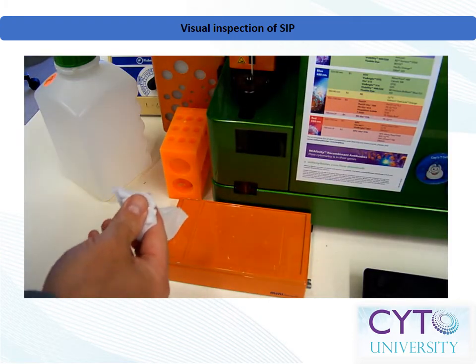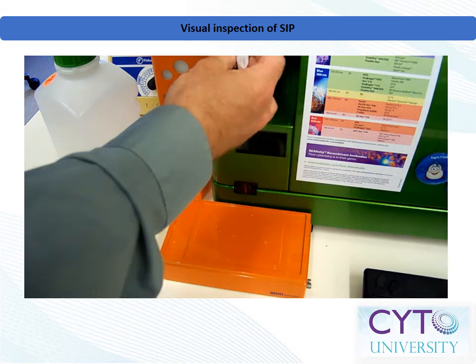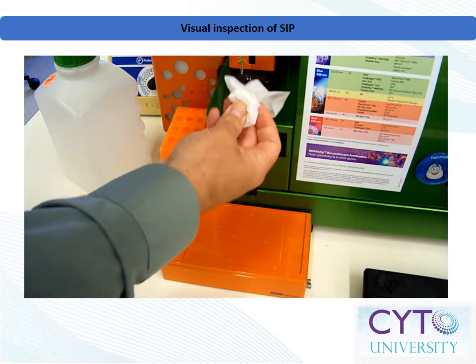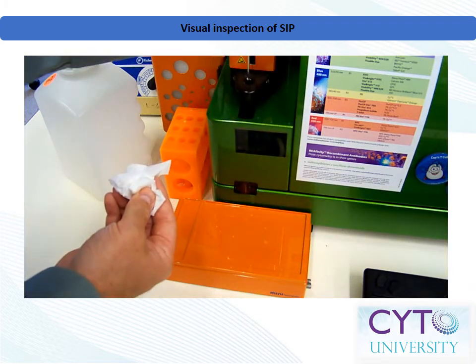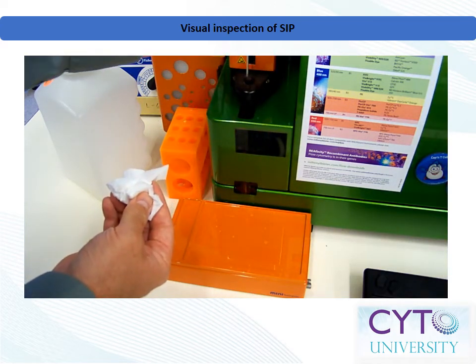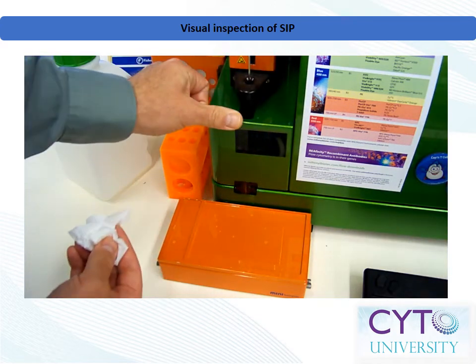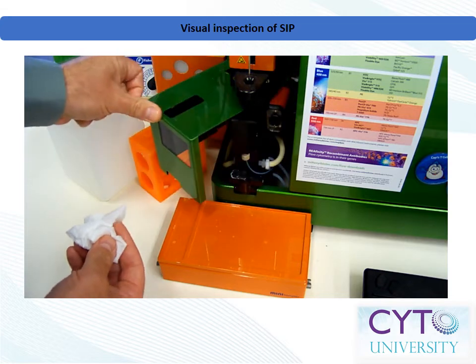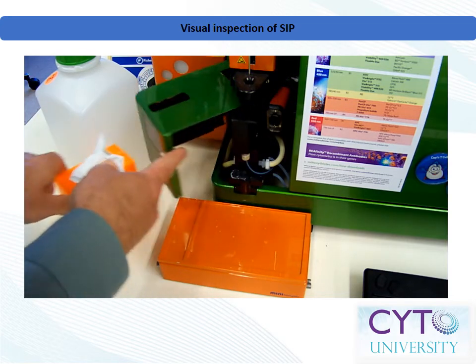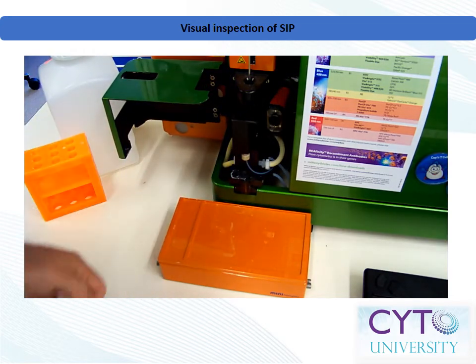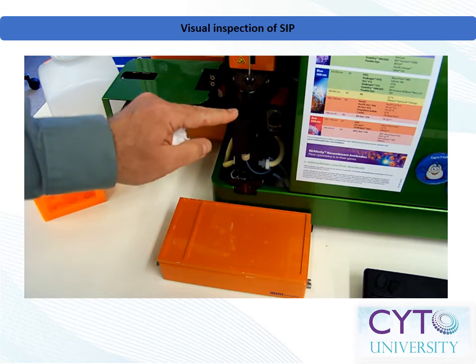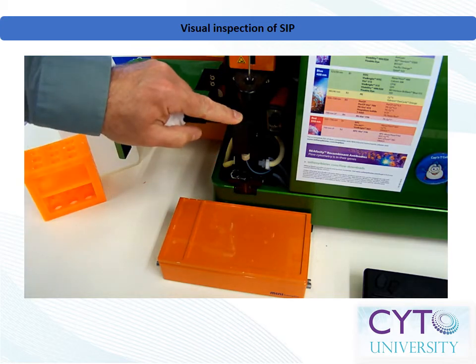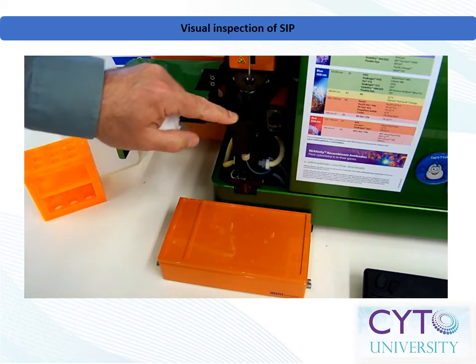For systems such as the example shown here, the needle arm is responsible for delivering the sample to the sample injection port. For this system, both the needle arm and sample injection port should be checked and appropriately cleaned.